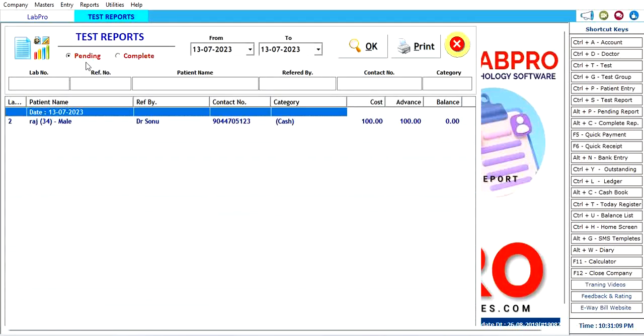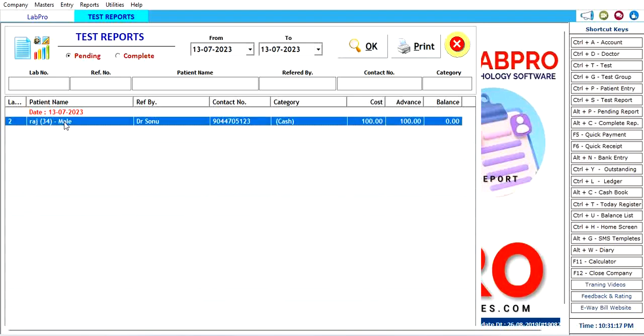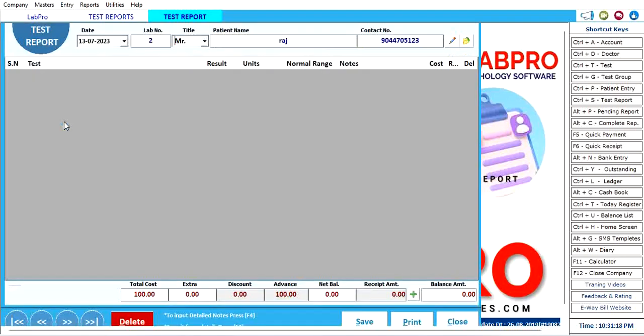If I see complete report, there is one complete report showing here and one is pending, which I made here right now. Just fill it over there.